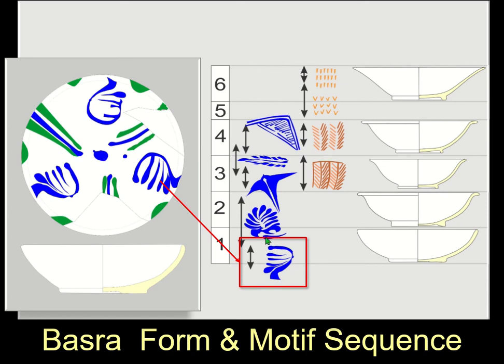And this is just examples of motifs. There's actually more than one. But again, you can see that they come in if you associate them, and again, you're also looking at forms. So it seems the forms are also associated with phases in which you get some, but not all, of these motifs.